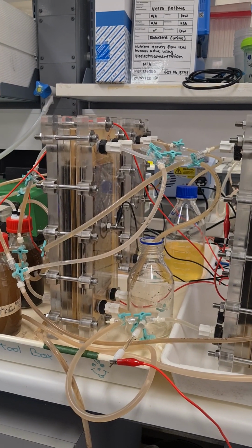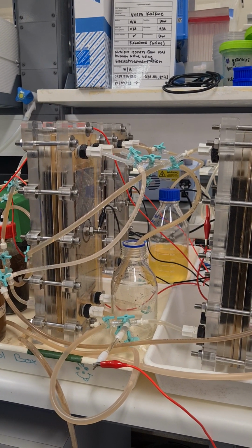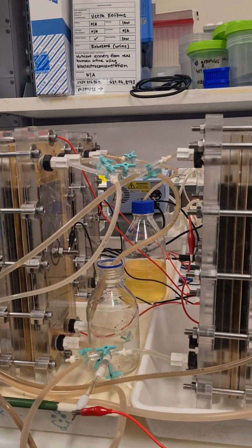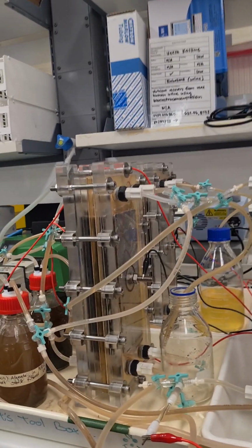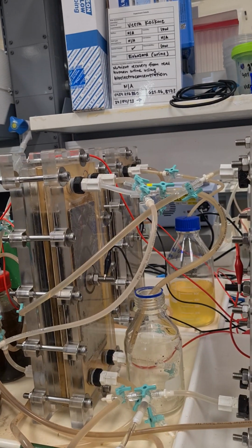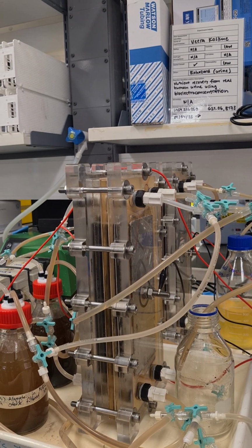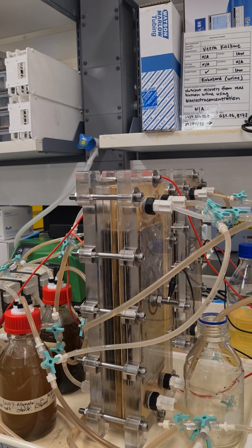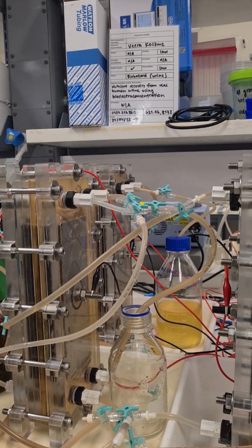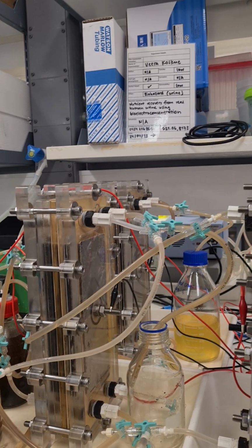One of the operational challenges that had been observed in previous lab scale systems was the accumulation of gas in the system, because as Stefano mentioned, acetate is oxidized to CO2 at the anode, and the cathode is producing hydrogen. Previously the mixing was provided just by circulating the anolyte and catholyte over a pump, but what we've now implemented are these phase separation columns, simple bottles where the gas is allowed to come out. That has been working nicely, so there haven't been any gas accumulation issues in the system. That will also be done in the pilot. If you remember from the photos in my presentation, we have these tall, narrow columns that will be doing the gas separation for the anode and cathode.